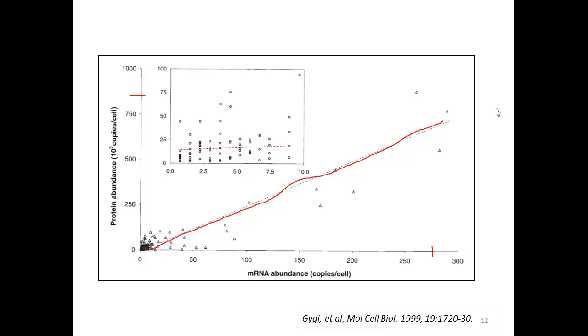The punchline is that you have to be aware of correlation coefficients because they're dominated by outliers. They are dominated by the largest values. There are only a few points here, maybe 6 or 7, where there are hundreds of points right in here. And so these 100 points are not having nearly as similar an impact as these 7 are here.